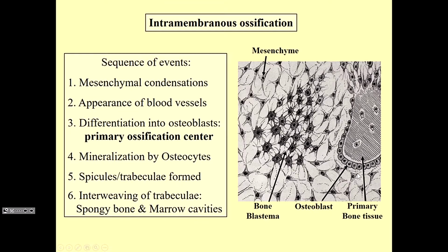Yes, this clear layer right here is the osteoid. The osteoid is always immediately beneath the osteoblasts. And when we look at a bunch of examples in the lab, and maybe a few slides momentarily, you'll see it always stains lighter. Depending upon the slide, it always stains differently.